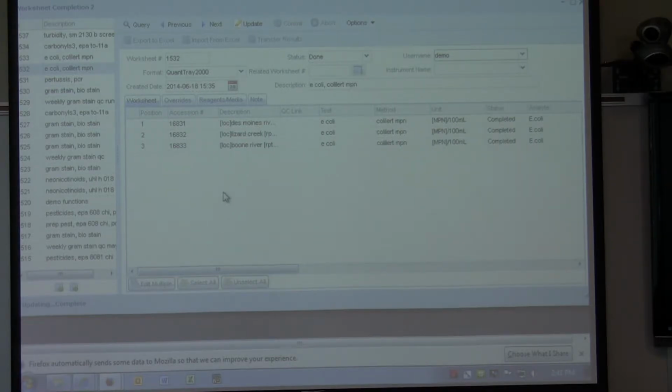Is there a message that comes to you when you go in and edit this? Let's say you forget to actually click the transfer results and commit. Will it tell you, hey, you went in and changed something, what do you want to do with it? So if you X out, you're lost? No, you haven't lost anything. It does go ahead and save it to the worksheet.